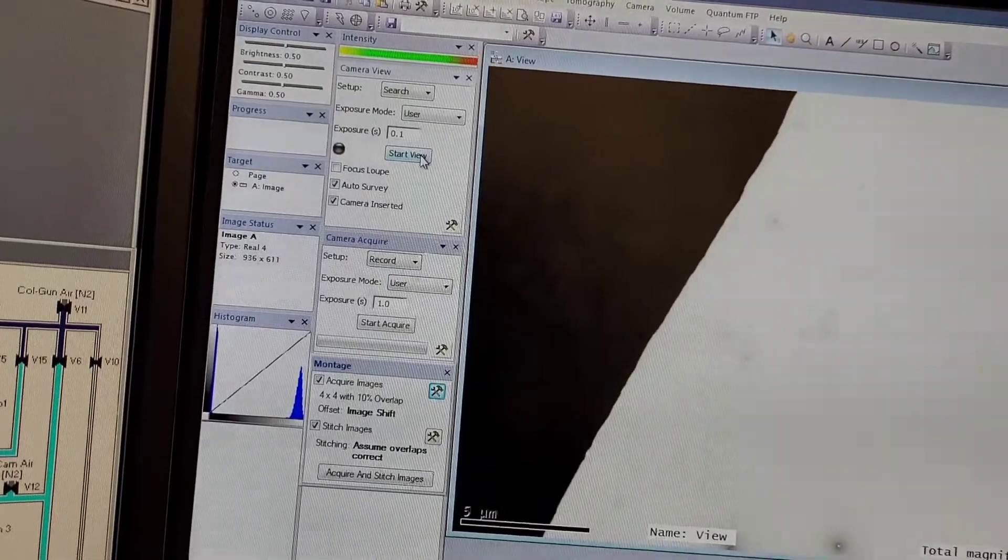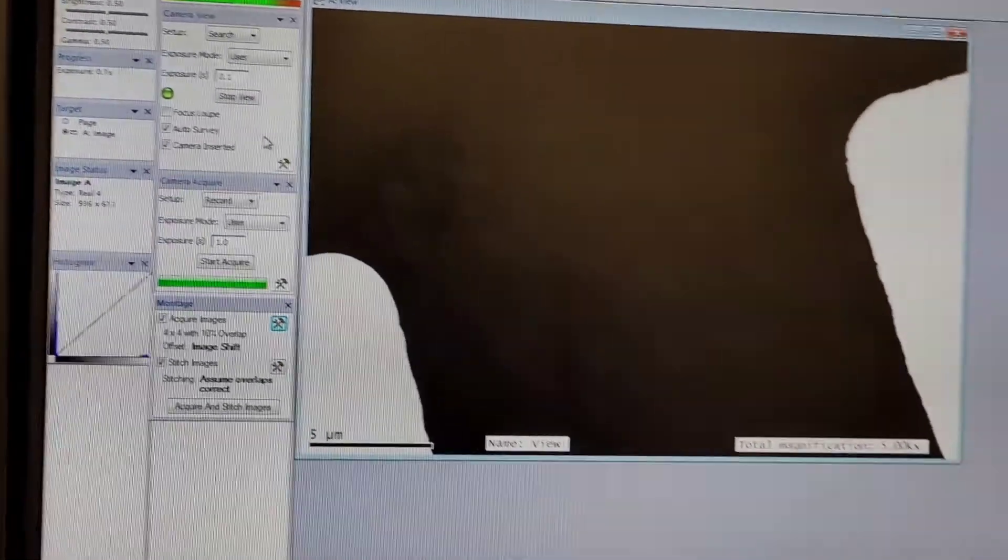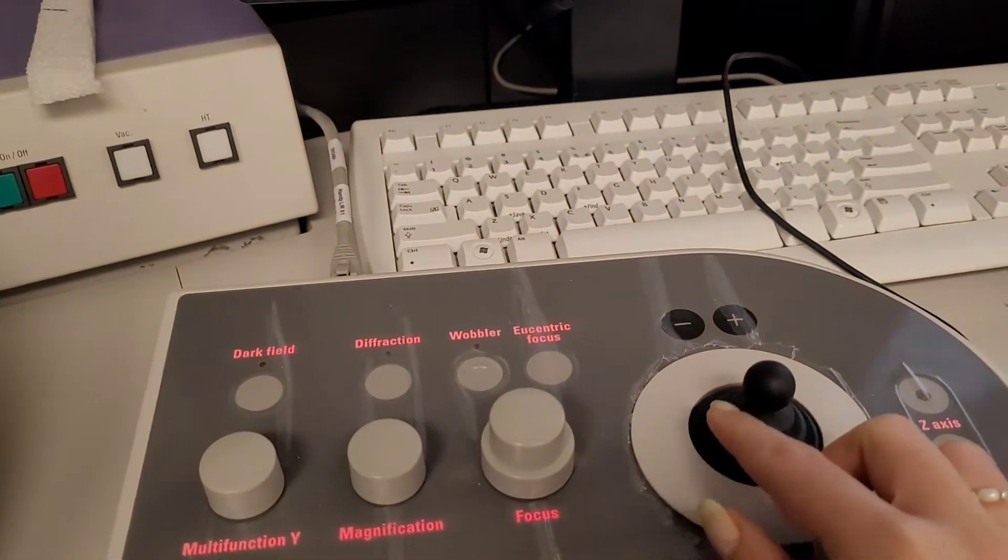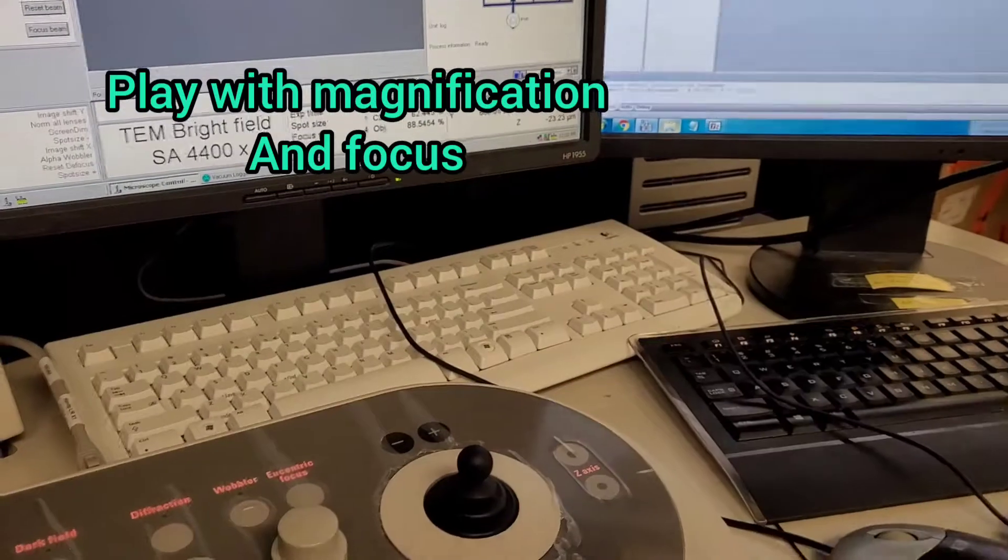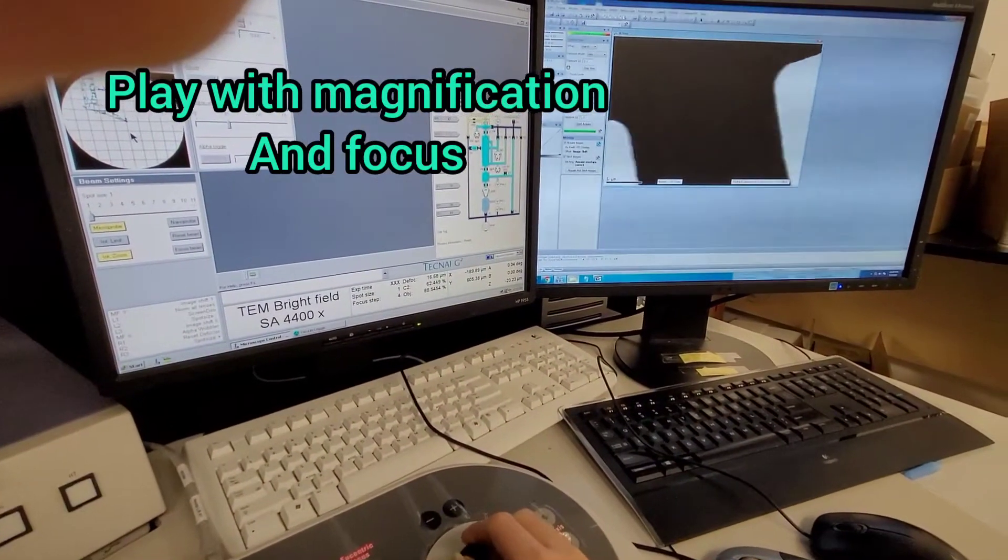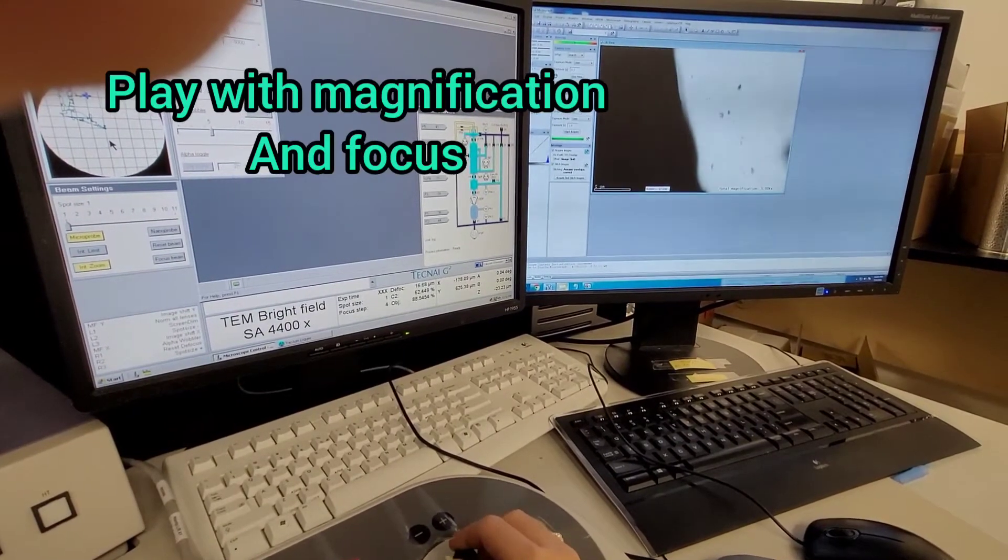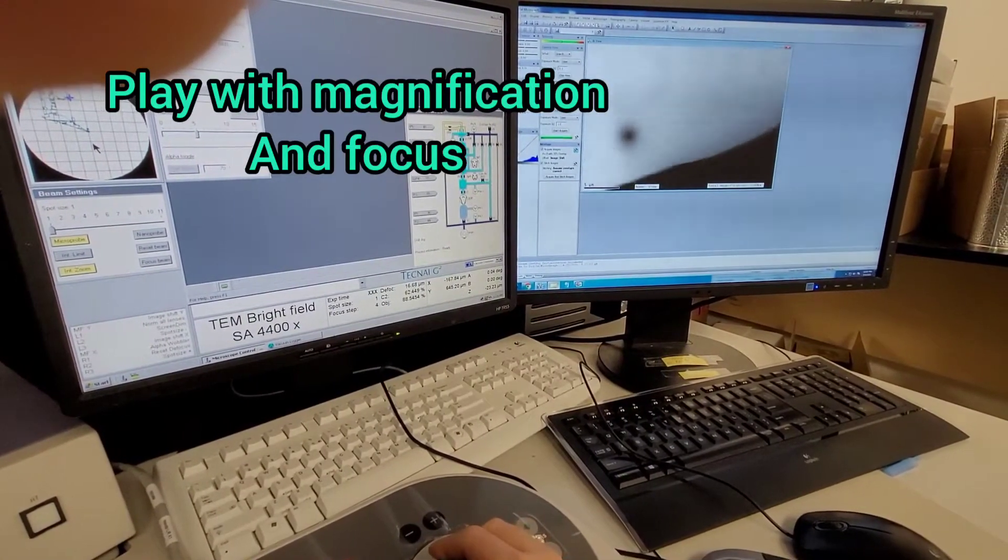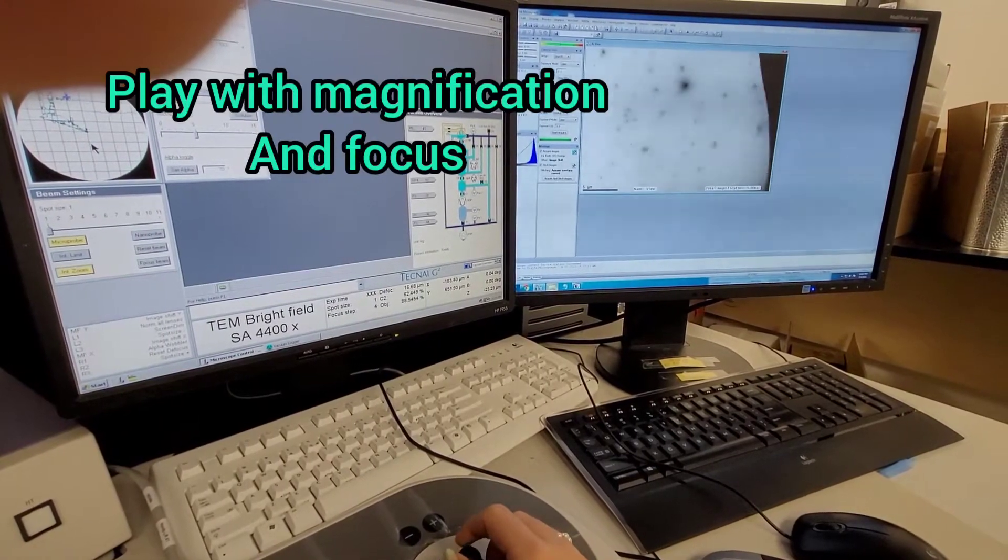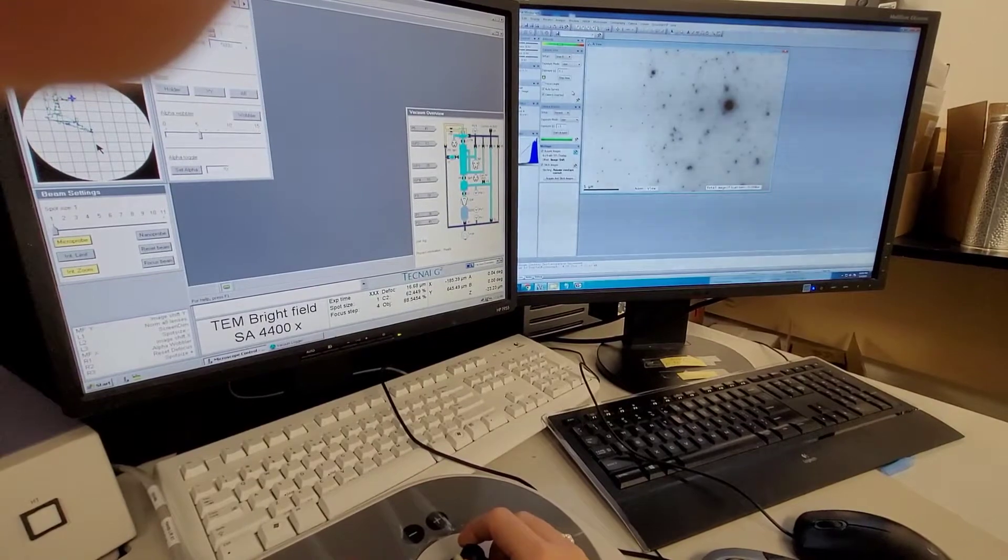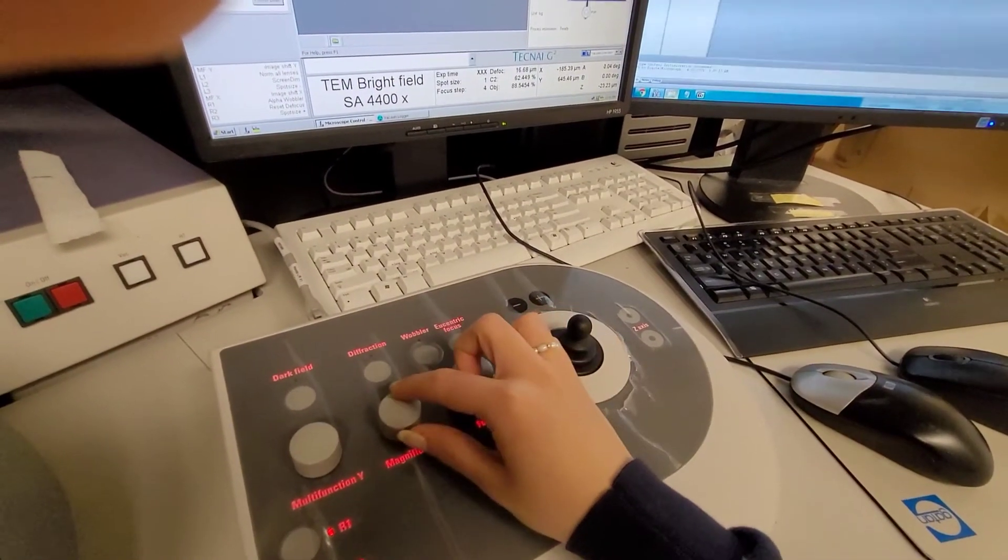Once that's done, you can start view and then you're going to see your grids. It's good to start when you're zoomed out because then you can see which grids are in good condition, which ones are broken, and which ones are good or bad. Then you choose a nice grid.